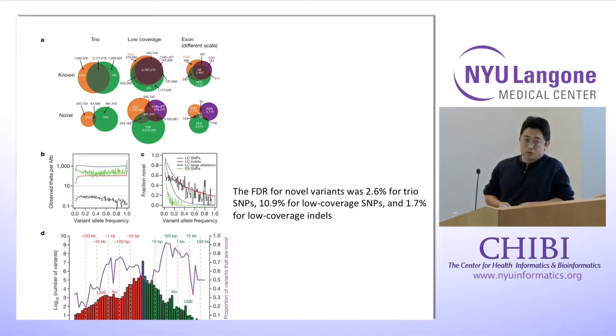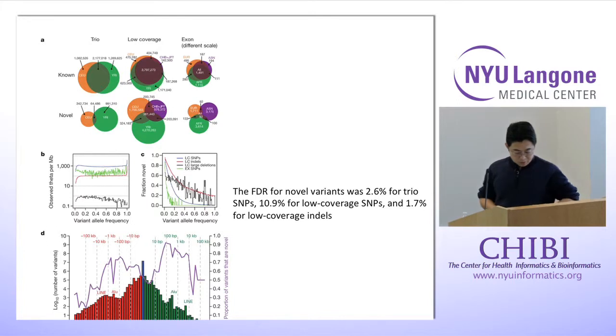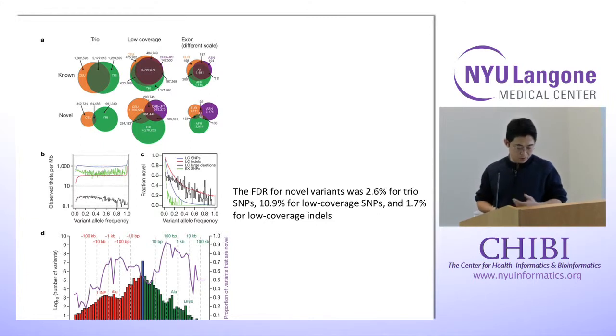When we filter variant calls from an individual sample, from our patients, we definitely need to take this into consideration when we refer to a public data set. The good news is that different groups are trying to improve this and include more samples for variant calling, to build a better data set to compare against.